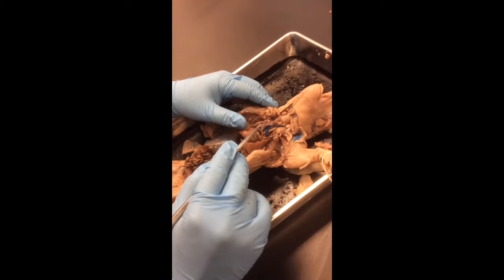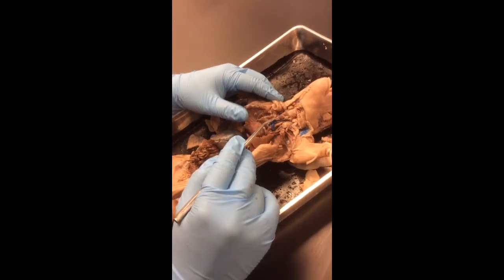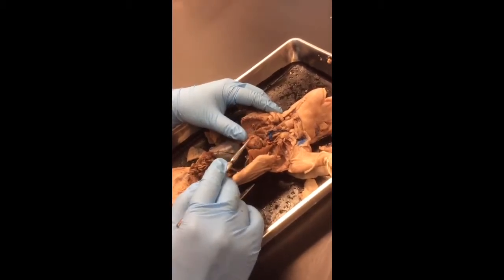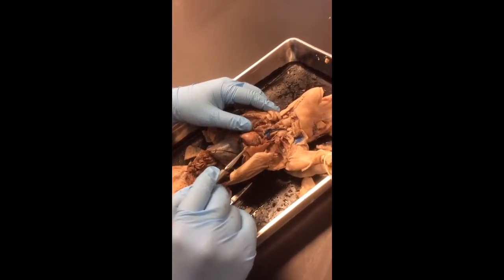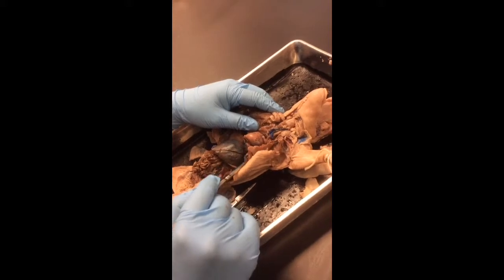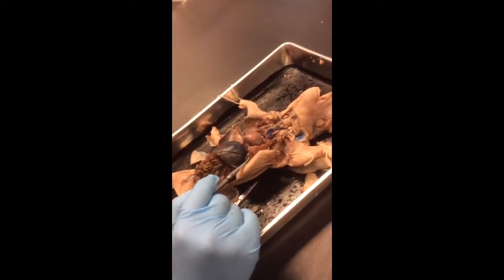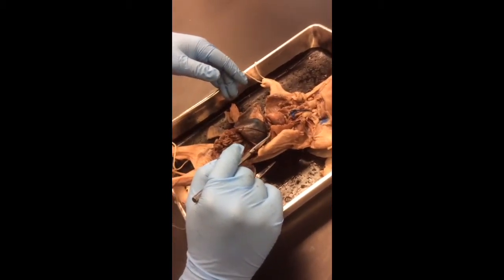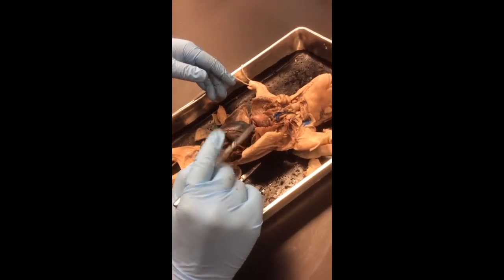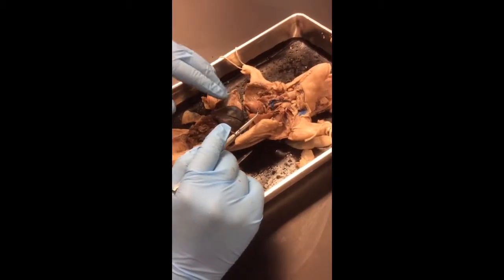Ductus arteriosus, foramen ovale. Do you guys remember what those are? What's the foramen ovale, ductus arteriosus, and ductus venosus? Those are the fetal shunts, right? The pathways that blood can skip the lungs within the fetus. Those are going to be on the written test. You should know those names and at least one of them, what it does or how it works. There's the ductus arteriosus, foramen ovale, and then further down, ductus venosus, next to the liver. Know the functions, at least one of them, how it works. It just sends blood around, so it doesn't go into the lungs. Right, you don't want blood to go to the lungs of the fetus.